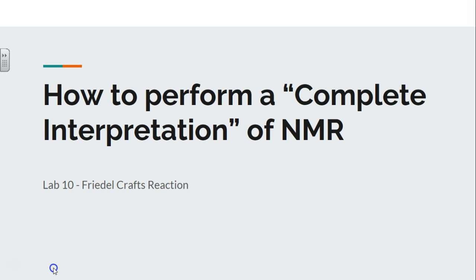Hey everybody, I wanted to spend a little bit of time talking to you about how to perform what I like to call a complete interpretation using NMR. Not only proton NMR, but carbon NMR. This should be used in conjunction with, not in competition with, Professor Sherlock's notes on how to interpret NMR and how to use NMR when you have a compound.